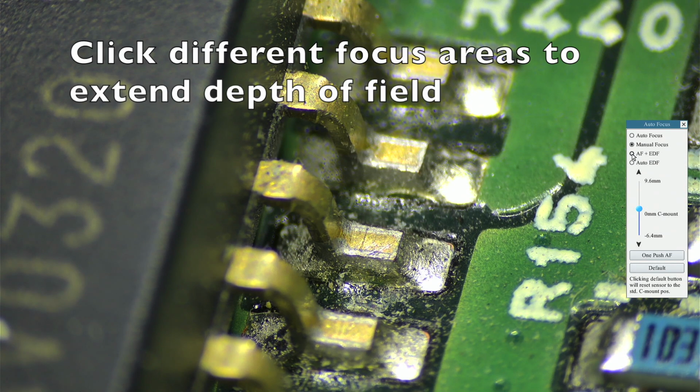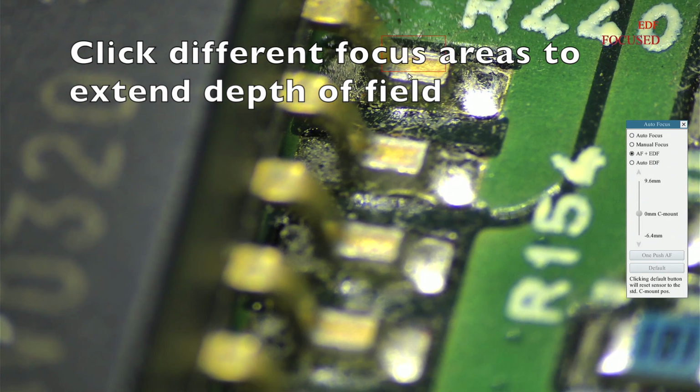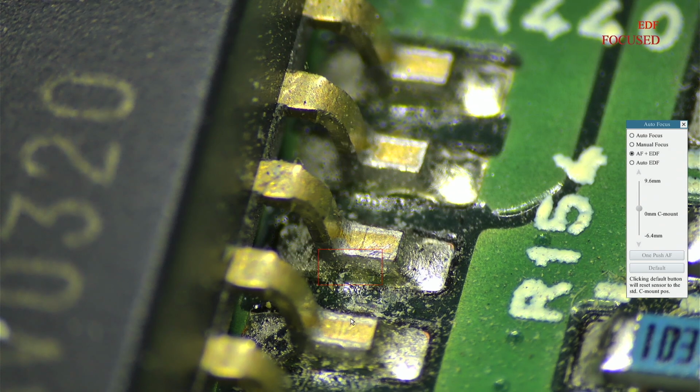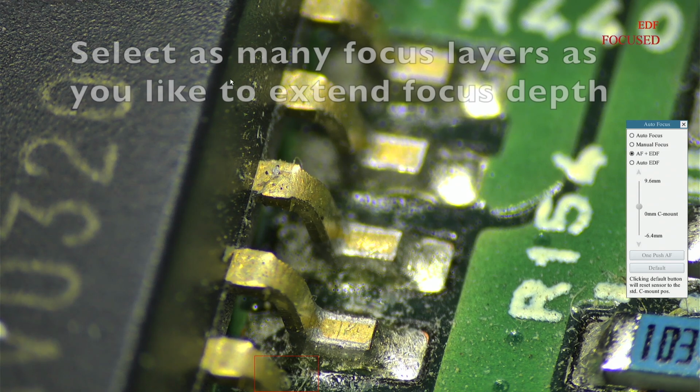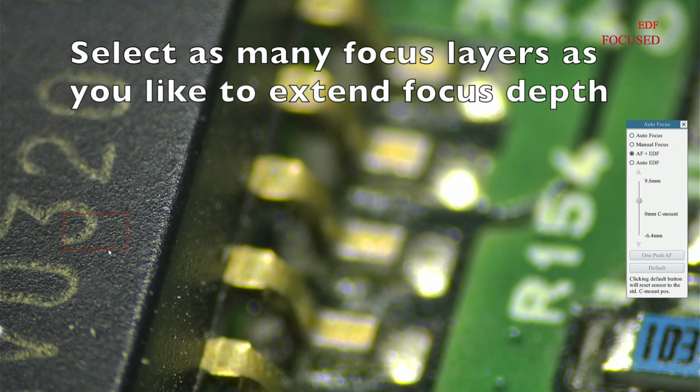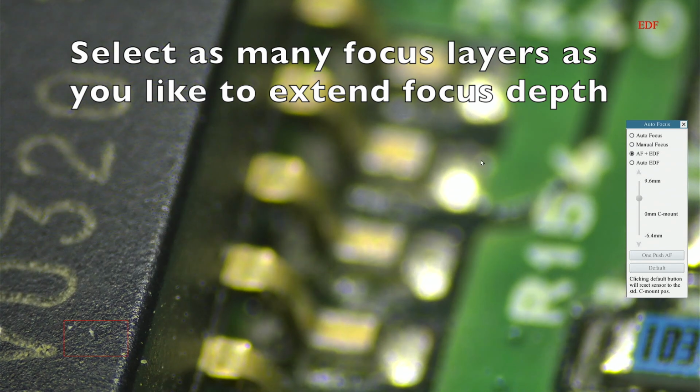Then click the area you want the camera to focus on. Wherever you click, the image will autofocus, and use that image to compile a final picture with perfect focus. For example, you can click different points of interest from top to bottom and from left to right. You can select as many focus layers as you would like in order to extend the depth of field.